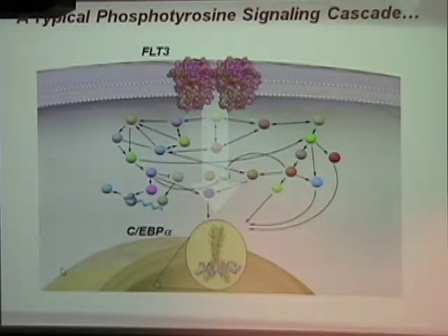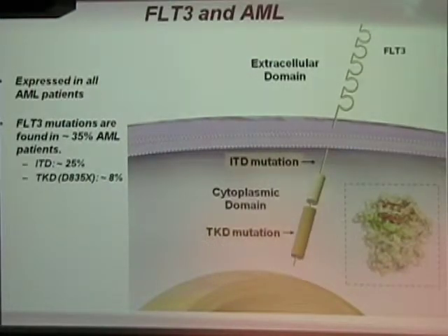So right there's a level of complexity in the proteomics in that we are not looking at the amount of entire peptides changing, we're looking at just the phosphosites. And what complicates this is that sometimes individual phosphosites will go in different directions on the same protein. So that's a level of complication that we're going to have to keep track of.